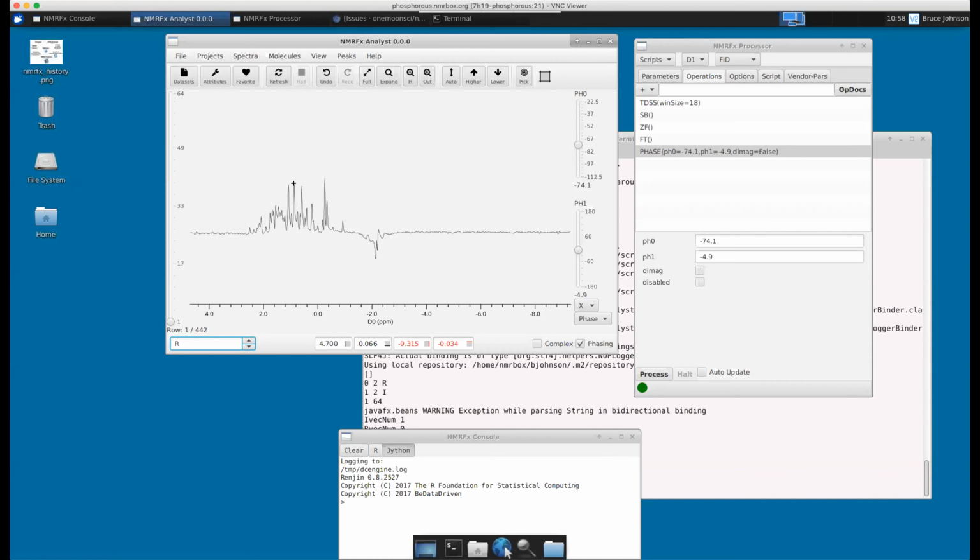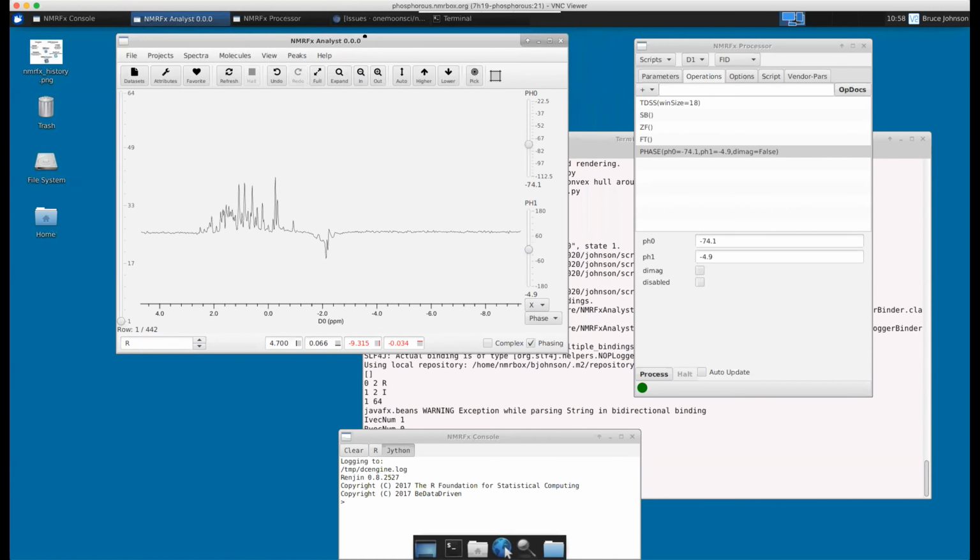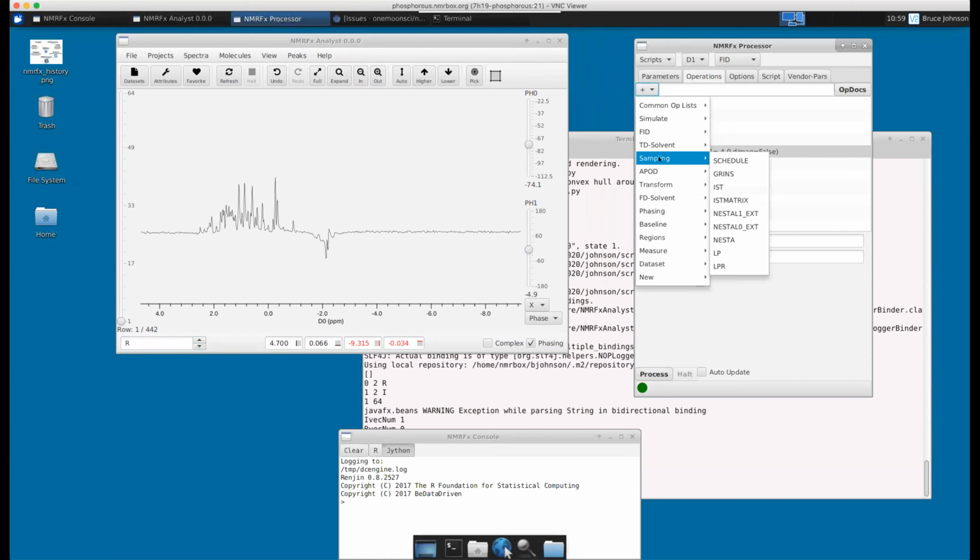It's a way to maintain more signal through the pathway of data collection, and one thing that was pioneered by Mark Rance. If you saw the homepage of NMRbox, like me, you may have been very surprised to realize that we lost Mark Rance about a week ago. So when you insert this command, I think we owe a lot of this to him.